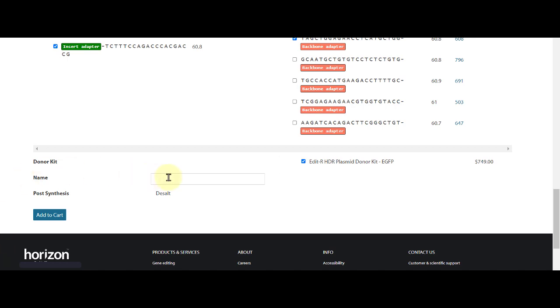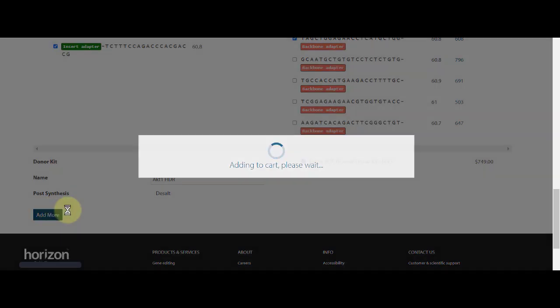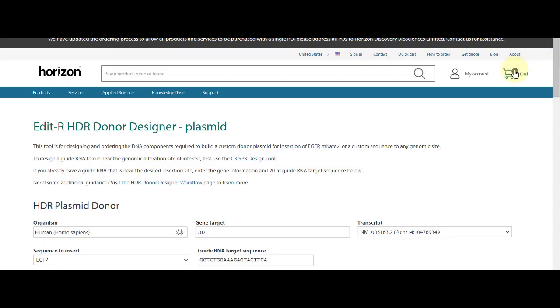Enter a unique name for the primer sets. Lastly, click Add to Cart. You are now prepared to check out with your order.